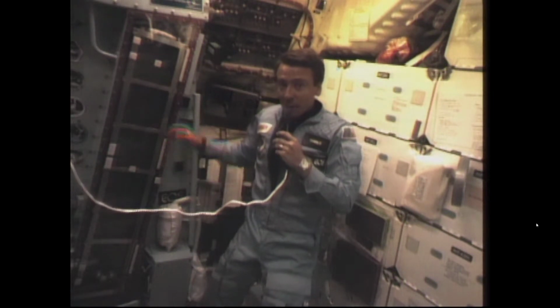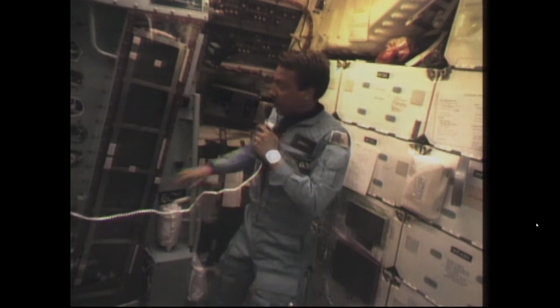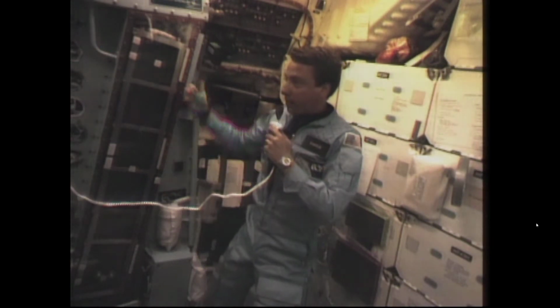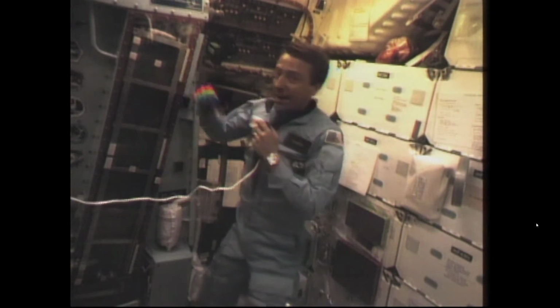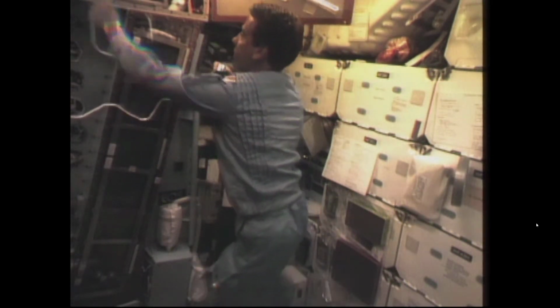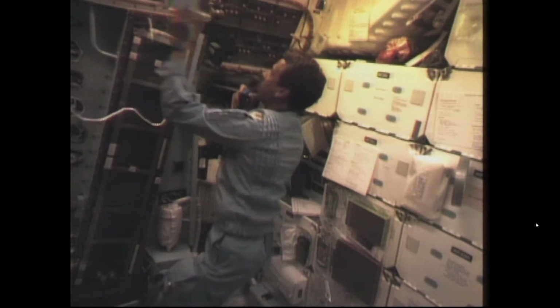Let me tell you a little bit about what you see here. The activities include not only the separation of the substances in the chamber as it's flowing continuously from bottom to top, or is that from top to bottom? I don't know which now. But at the outlet, I can test for the presence of various materials up in this area by retrieving samples with syringes.